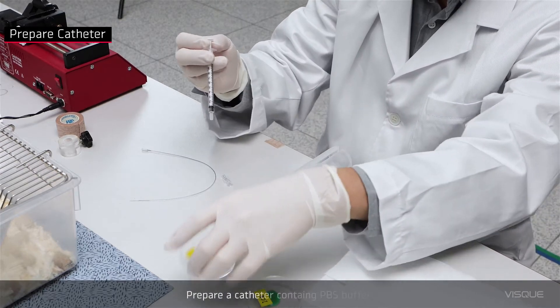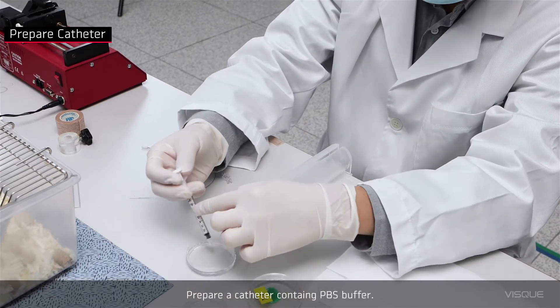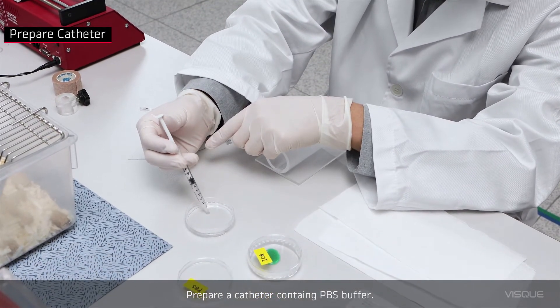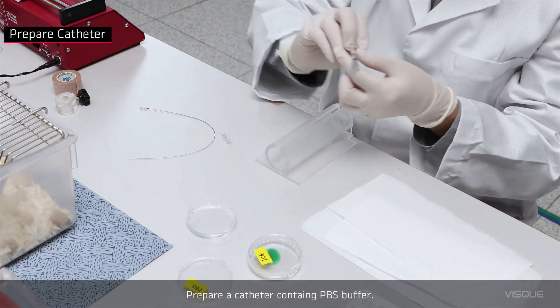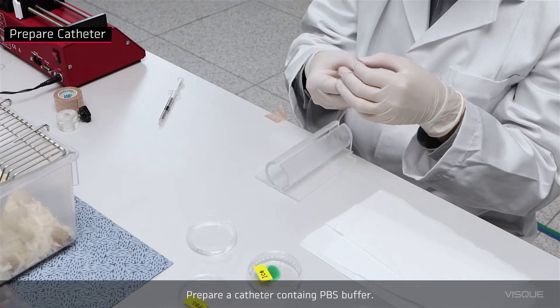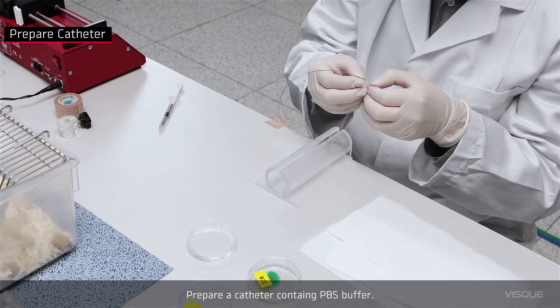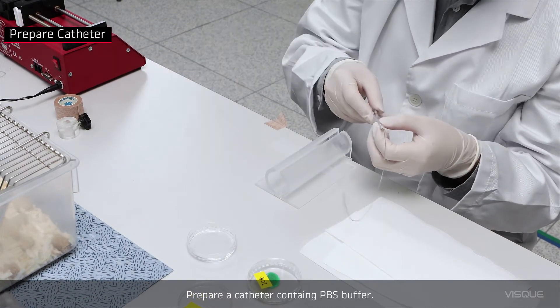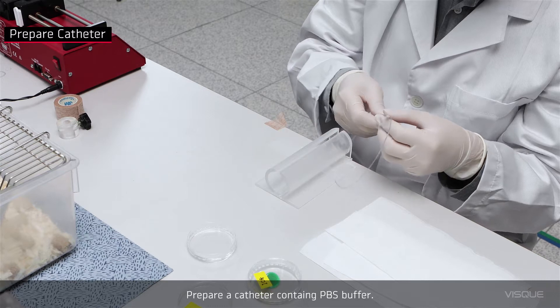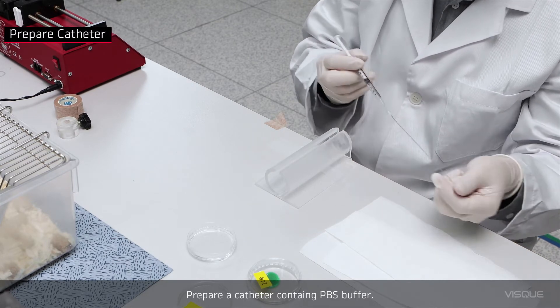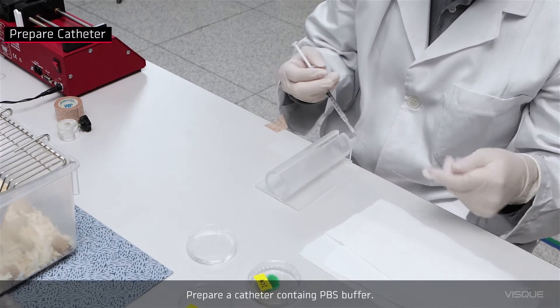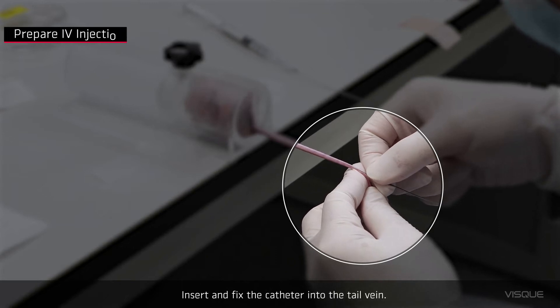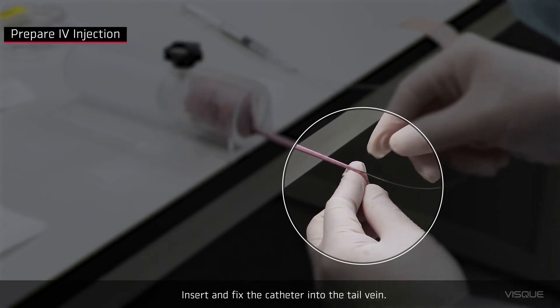Prepare a catheter containing PBS buffer. Insert and fix the catheter into the tail vein.